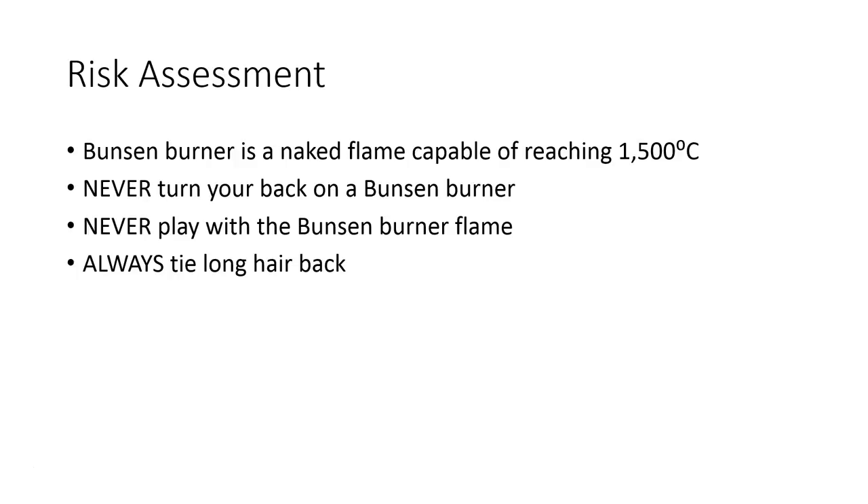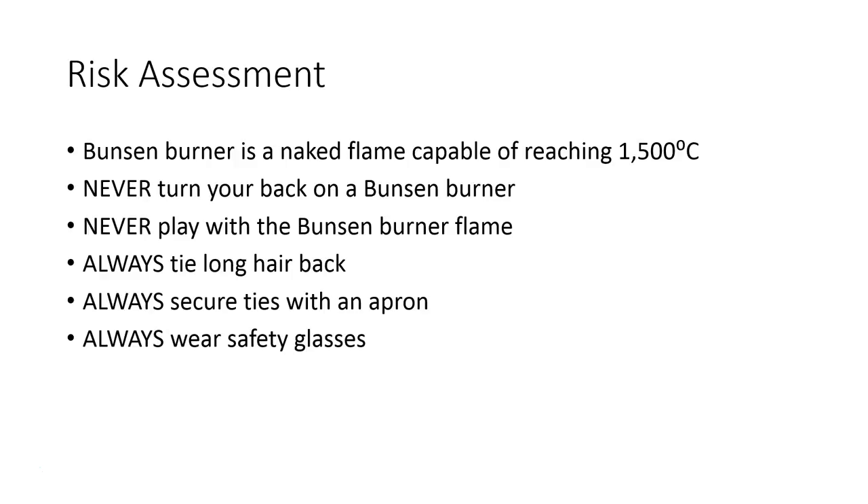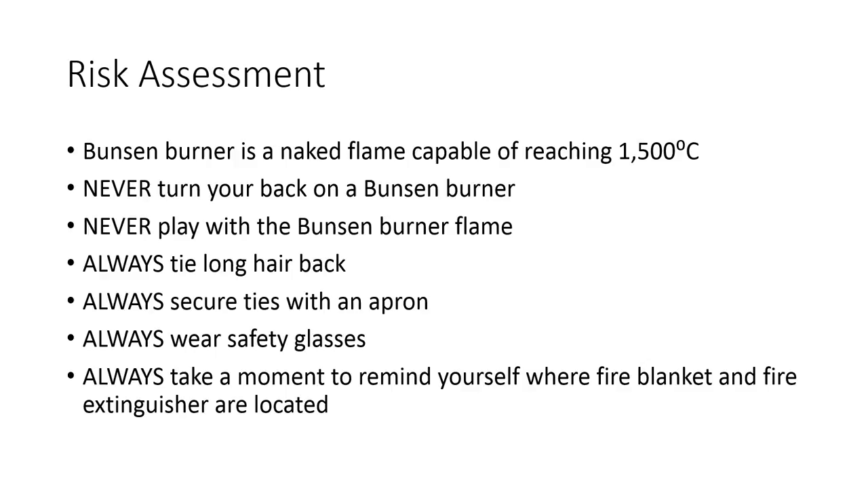Always tie any long hair back. Gentlemen, always put an apron over your tie so that your tie can't slip into the flame and become lit. Always wear your safety glasses, and always take a moment to remind yourself where the fire blanket and fire extinguisher are located.